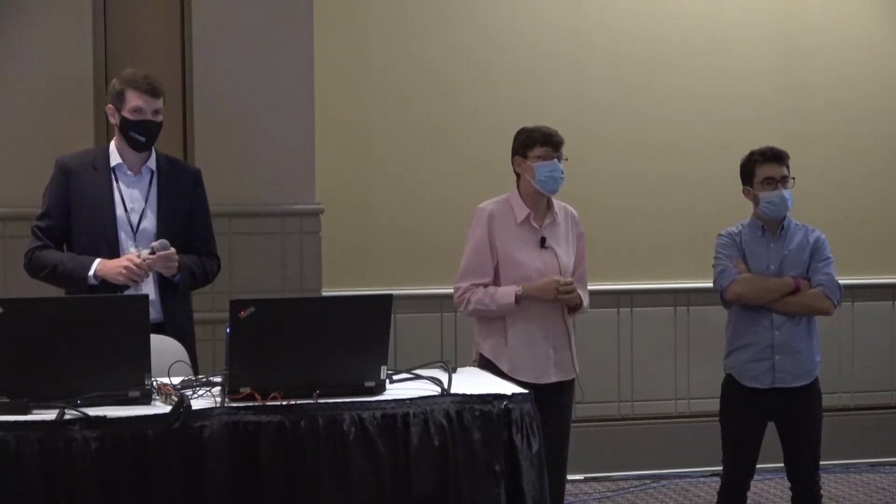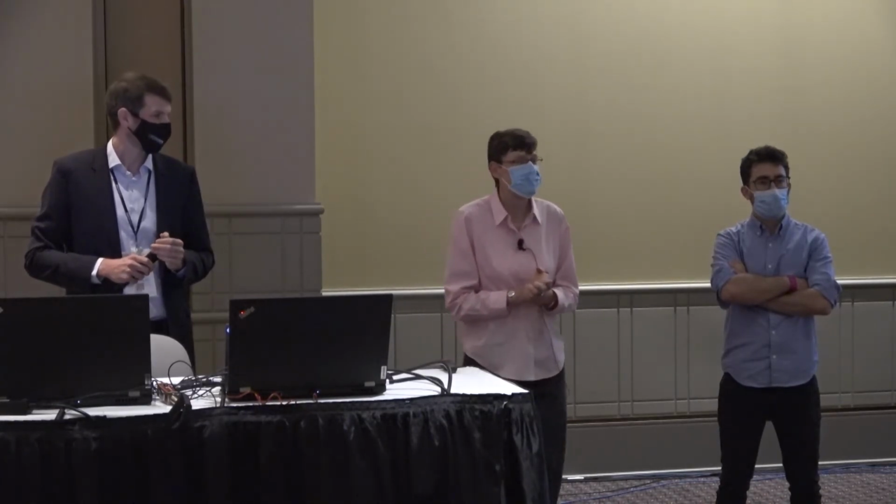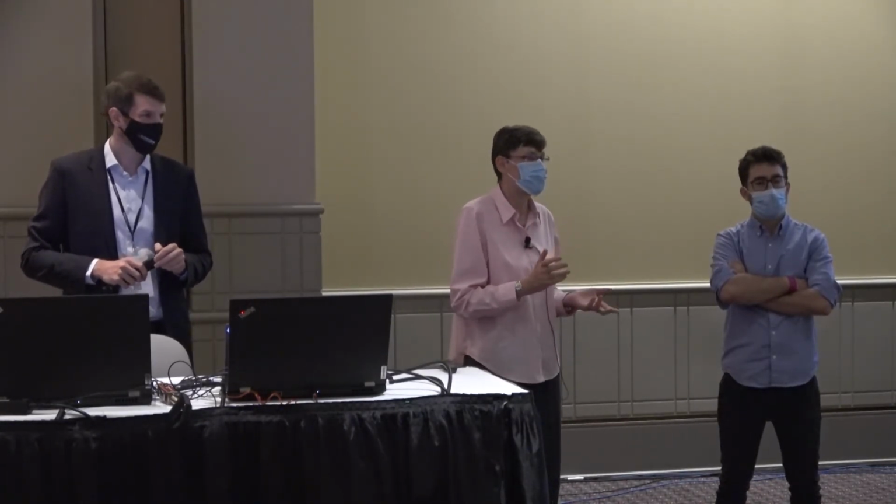And for DDA LFQ, for example, that would be really difficult, and that's why I think DIA is so nice for this type of workflow.